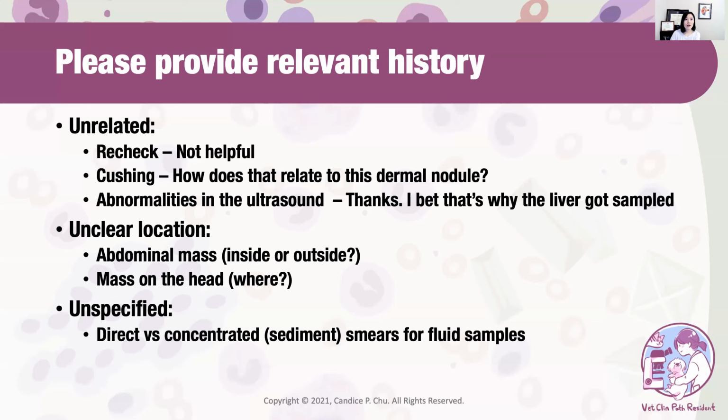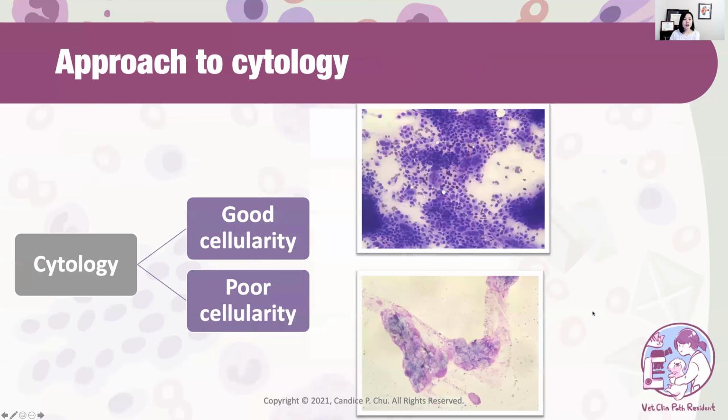That would change it from a normal fluid to an inflammatory process because of the increased cellularity. So be sure to specify whether this is a direct smear or you have concentrated the fluid before making the smear. All right.